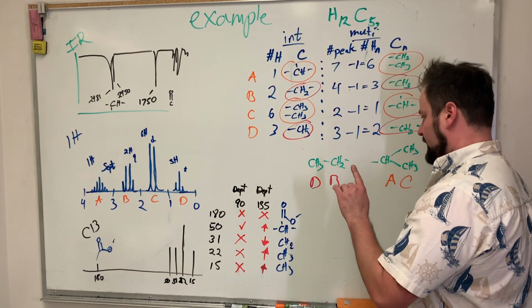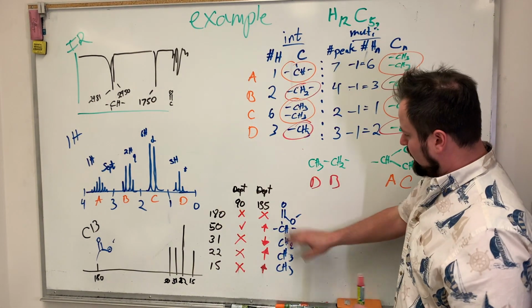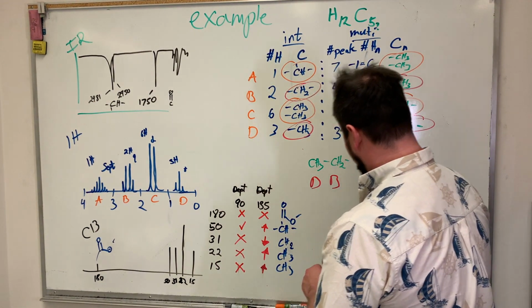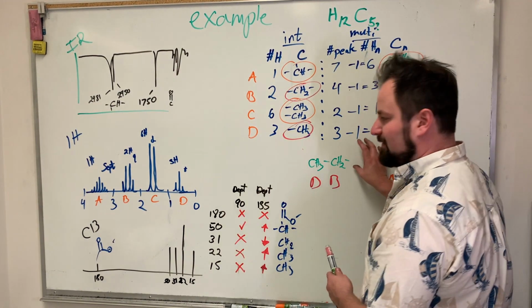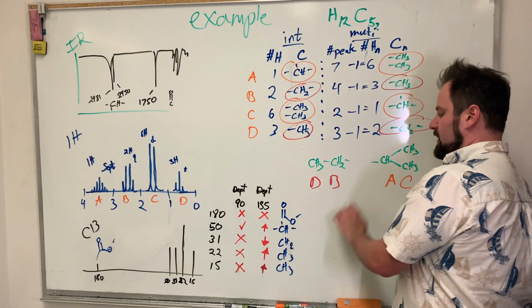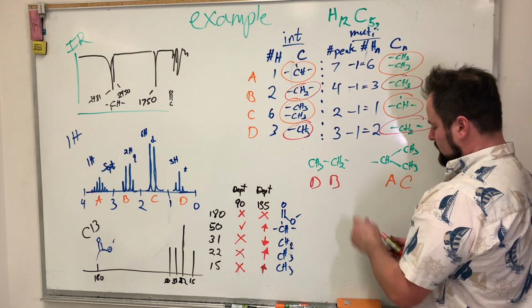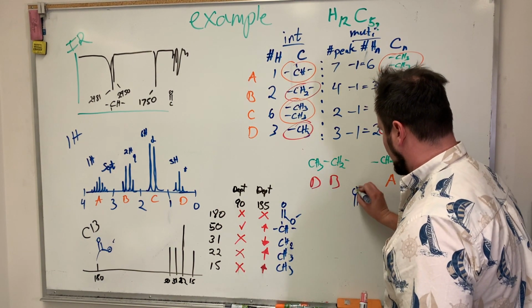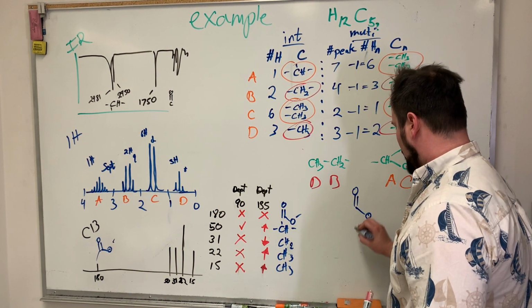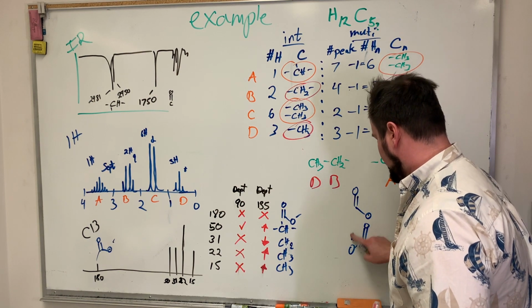Now, we know that we're going to have an ester, and we know that we have these. So, for our compounds, when we label them, we need to figure out how to put in our ester, and then we'll label these in a moment. But they all line up with what we already expect. So for our ester, we have 2 options. We can either put it this way, or we could put it this way.